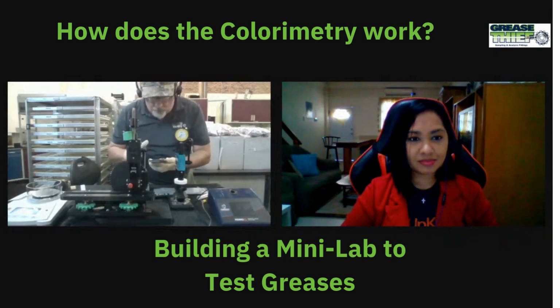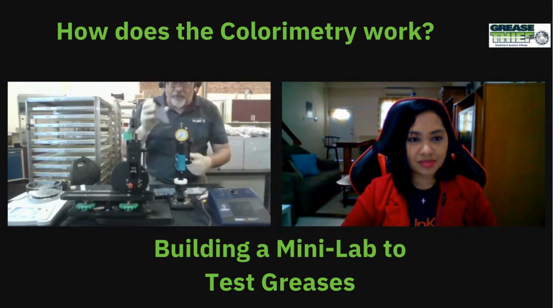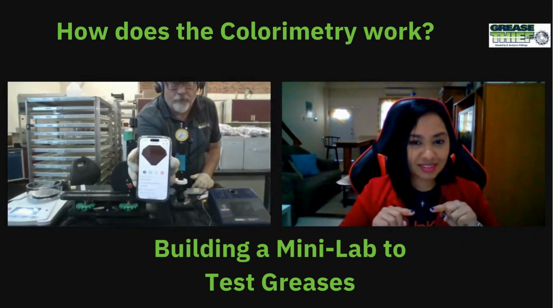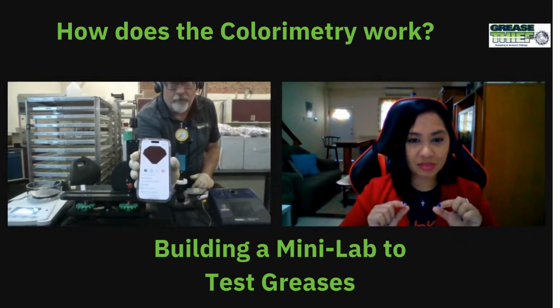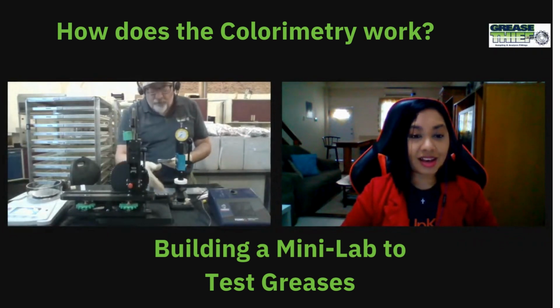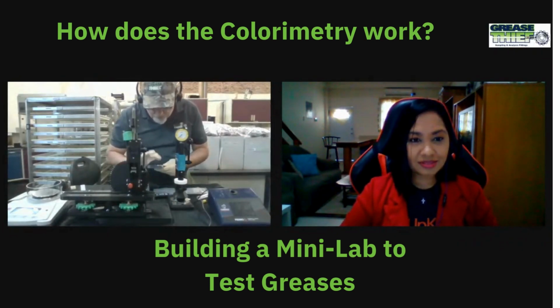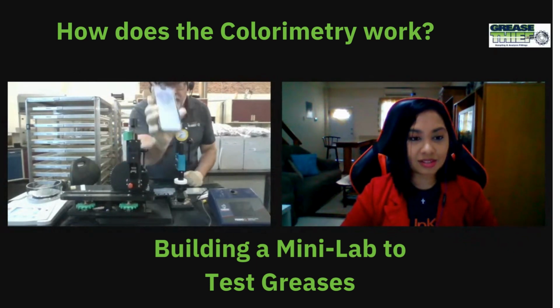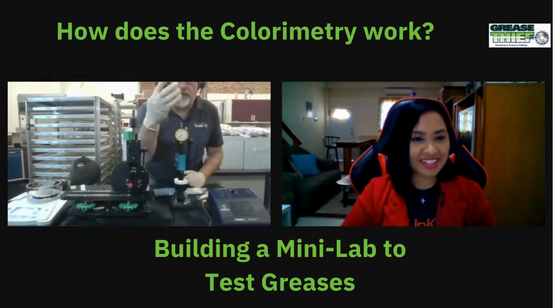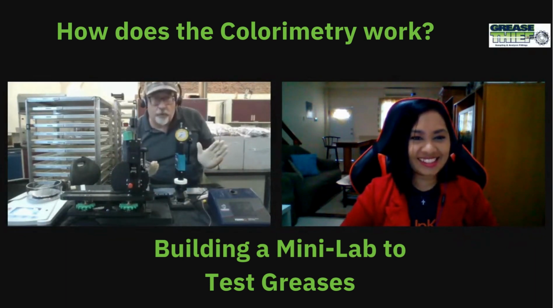And I want to show something else with this. You were able to see my screen decently there? Decent. I could see the diamond for sure, but it's a little bit difficult to make out the text. Well, let me change the diamond up because this software is all Bluetooth to the spectrometer that's down here. Let me see if I can. There's going to be a different setting here, which is a compare setting. And can you see the diamond? It's just lines now. There's now 2 halves to it.